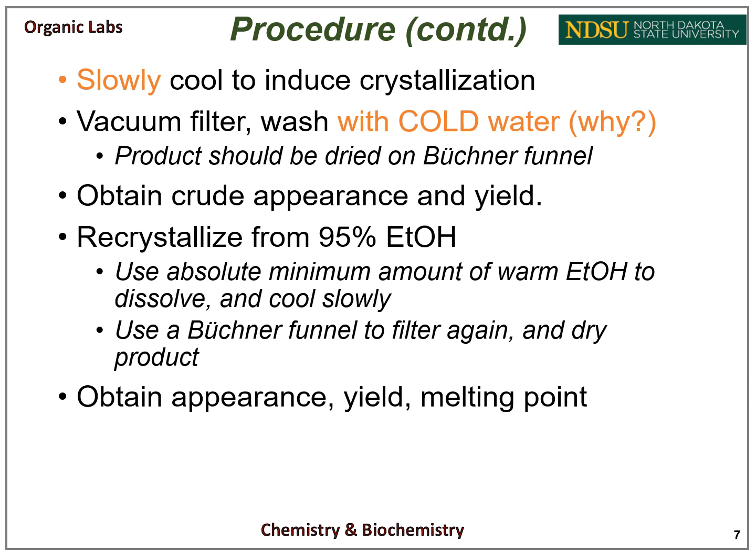After this, we will be doing a recrystallization using hot 95% ethanol. You'll want to use as little ethanol as possible to dissolve your product. Again, you will filter and allow your product to dry before you obtain appearance, yield, and melting point of your recrystallized product.